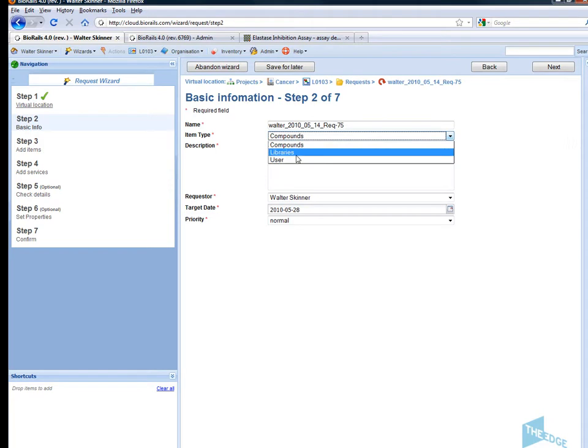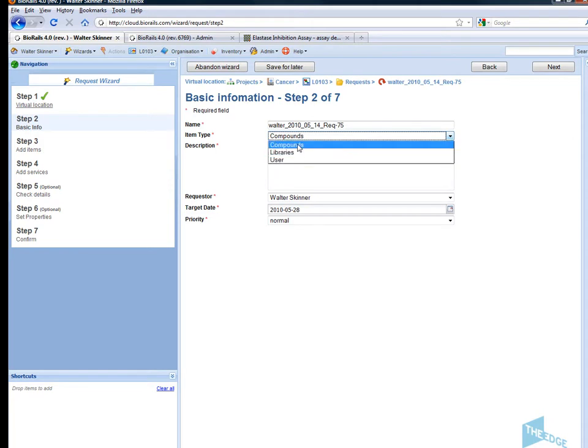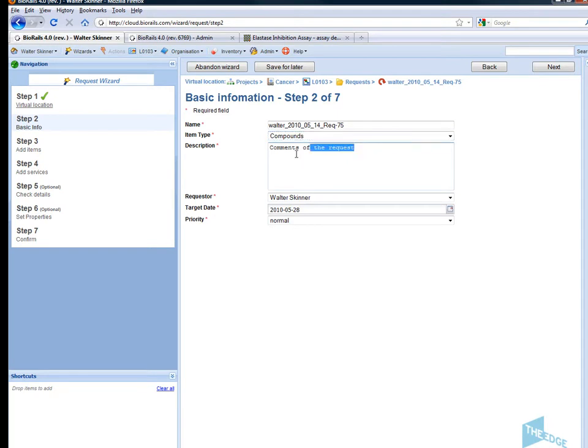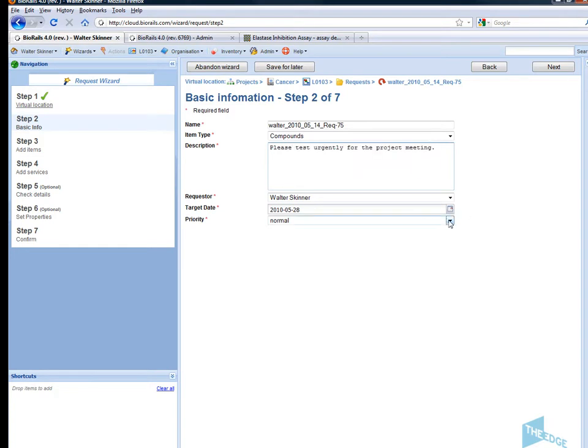But I can quickly make requests based on other items such as libraries, assays, and other entities in the system. Now I'm going to pass a message to the service team. I can give a priority and also a target date.